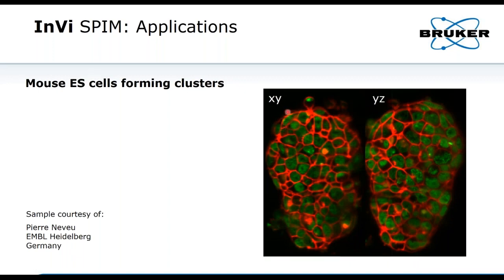So you see illumination is here from the left, and you see that there's some shading going on, and the question is, can we somehow help to remove this? And yes, the answer is yes, there are ways to do this. I will come to this.